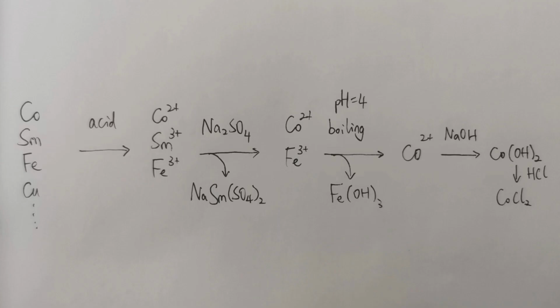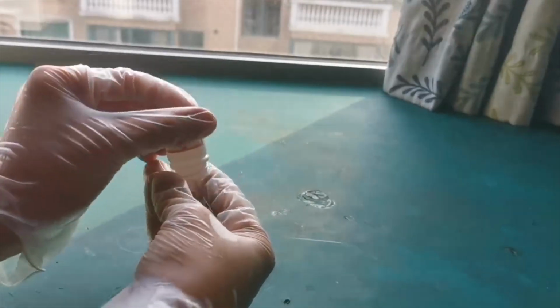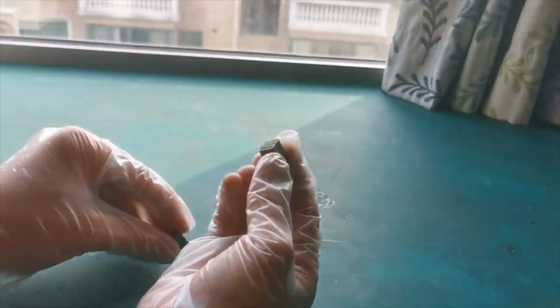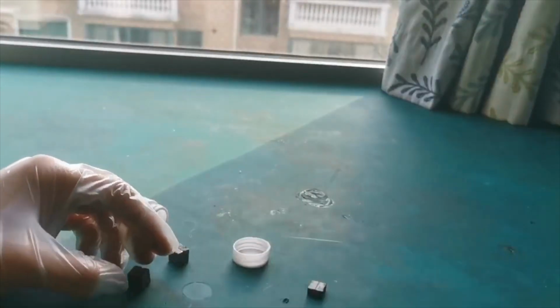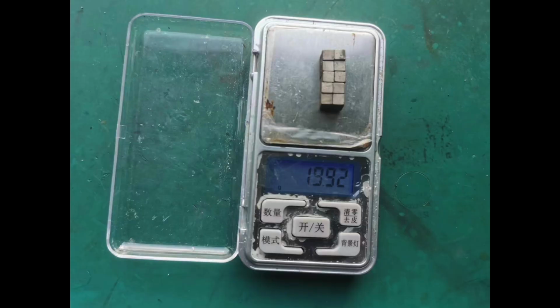The basic plan is to dissolve the magnet in acid, selectively precipitate the lanthanides, and then separate the cobalt from other impurities. Here I have my samarium-cobalt magnet. It is in 10 smaller pieces and it has a dull gray color due to surface oxidation. However, it is notably more corrosion resistant than neodymium magnets, which are often coated in a layer of nickel for protection. I weighed the magnet, and its mass is 19.92 grams.